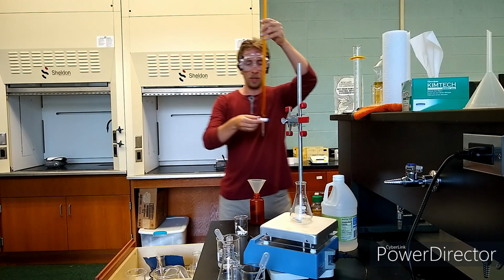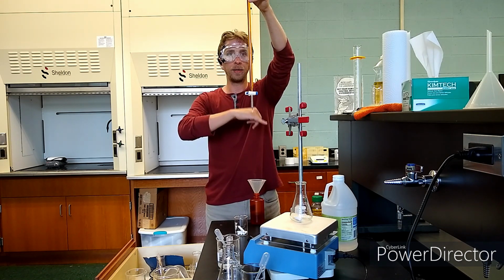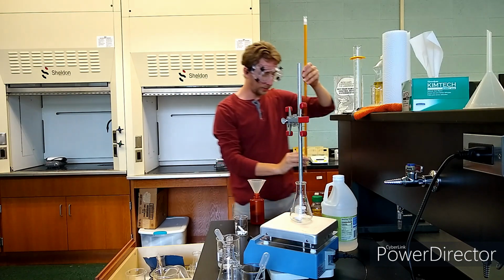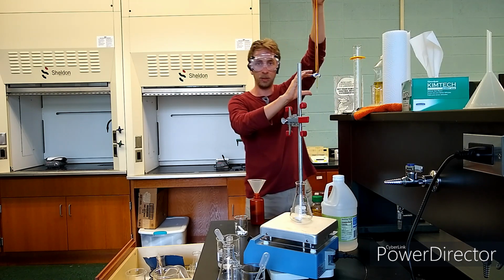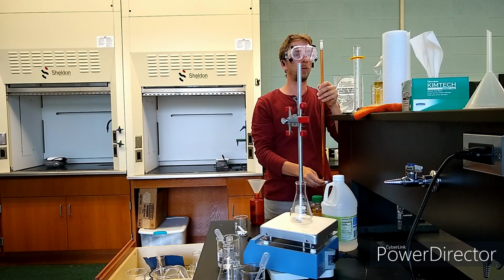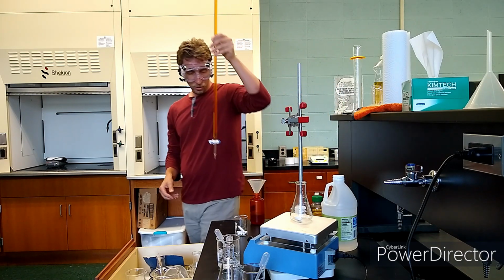And then I will open up the stopper very quickly to knock out any bubbles in the tip and drain them down, and also to rinse the tip out. And I will drain it down to start exactly on the 0 mark on the burette. Okay, so the tip is nice and filled, no bubbles in the tip of the burette to throw off the volume measurements. And now I'm just going to drain it so that the bottom of the meniscus starts exactly on 0 on the burette. That's a convenient starting point, 0, right? Let's see here. Okay, there you go.